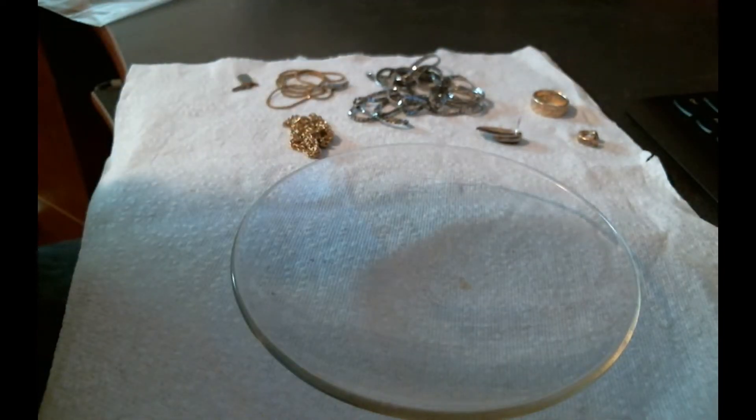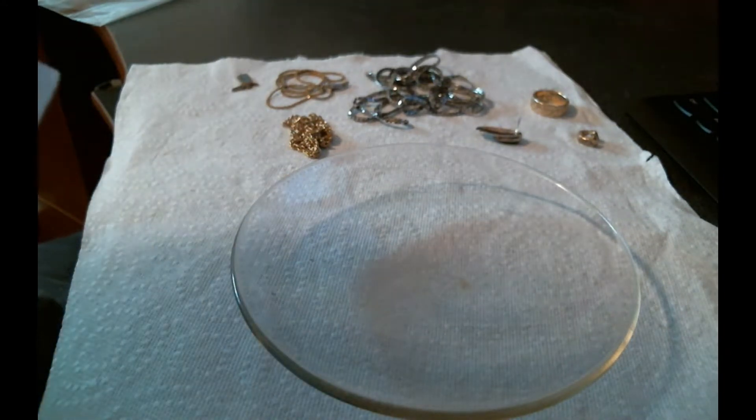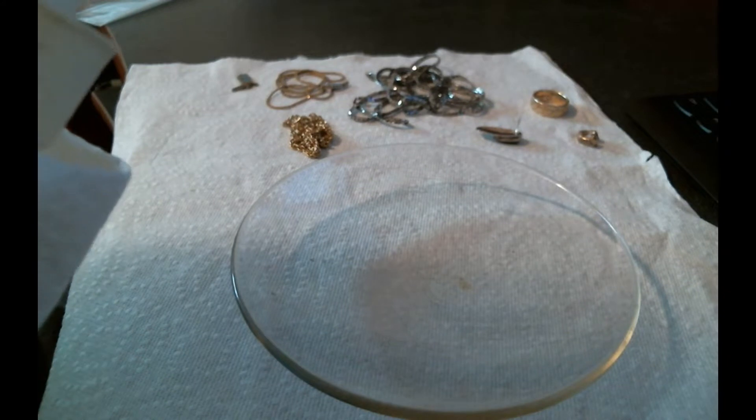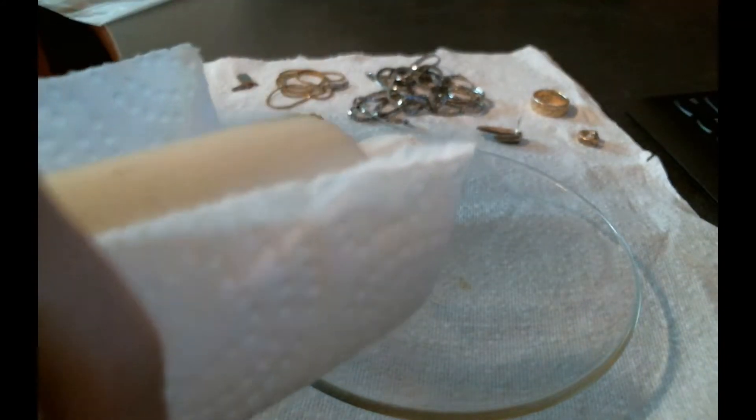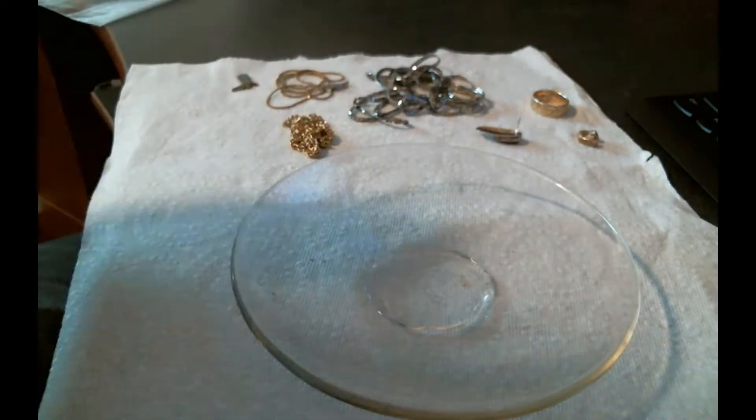Hello everybody, this video is about how to acid test jewelry. We're going to use 10 molar nitric acid. I've got a little bottle here and we're going to pour it into this dish that I've got for the demonstration.